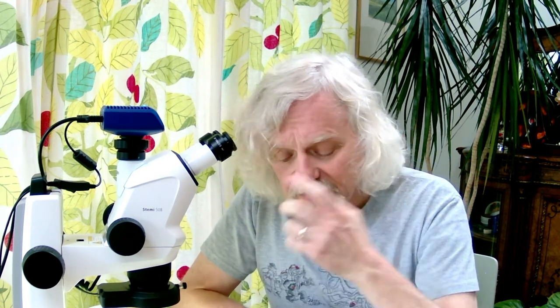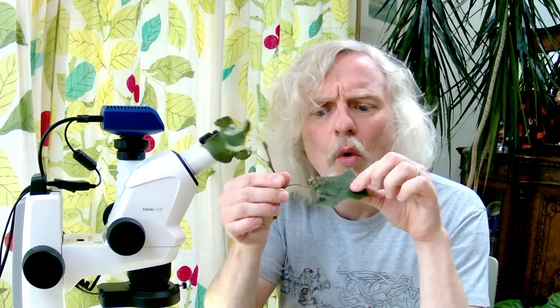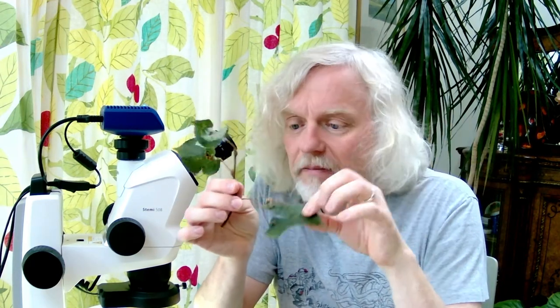Hello everyone, welcome to Micro Minute. My name is Marty Jopson and under the microscope today I've got a specimen that my wife noticed when we went out for our socially distanced walk this weekend. She saw a tree that had some peculiar growths on it. We both knew that these were what are known as leaf galls, but I didn't really know anything more than that, so I went back, plucked a few leaves, and I thought we could take a look at them and find out what's going on under the microscope.